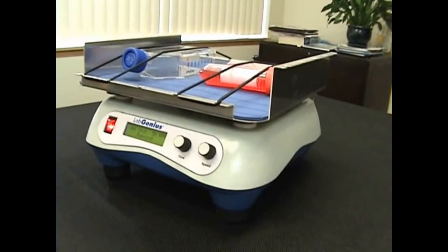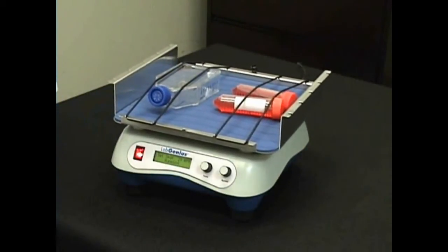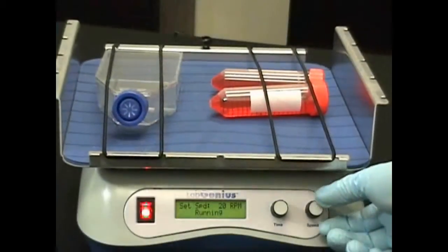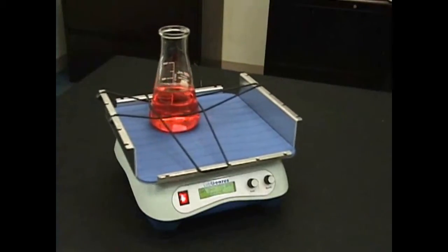Low RPM and gentle shaking is ideal for molecular biology, western blot, and immunology applications. High RPM functionality provides vigorous agitation for culture applications up to 300 RPM.